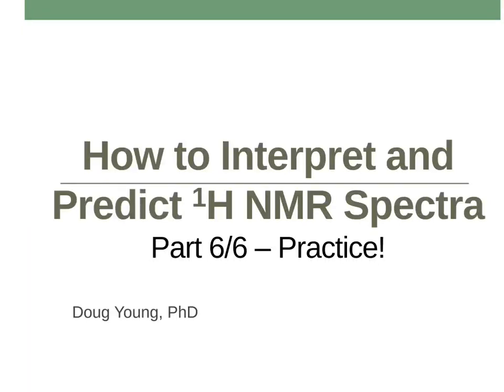Young. In this video, we're going to finally practice all of those things that we learned in the previous videos. We're going to try to put it all together.